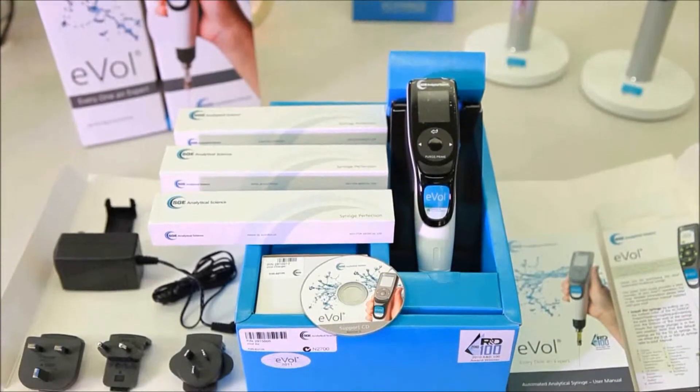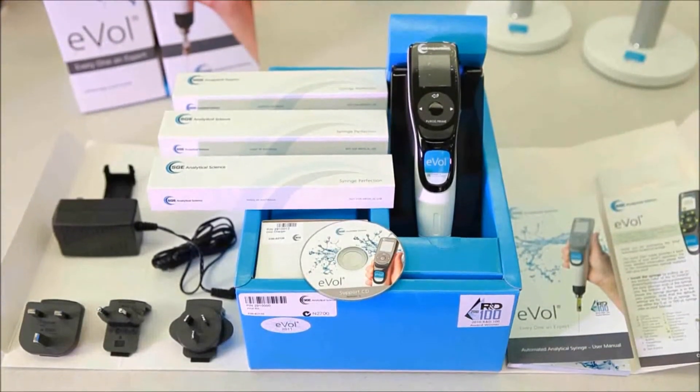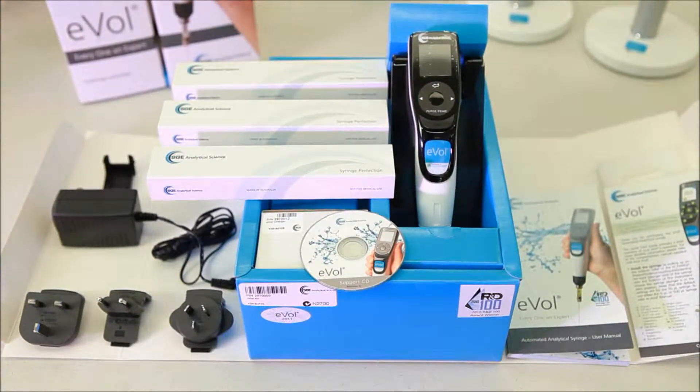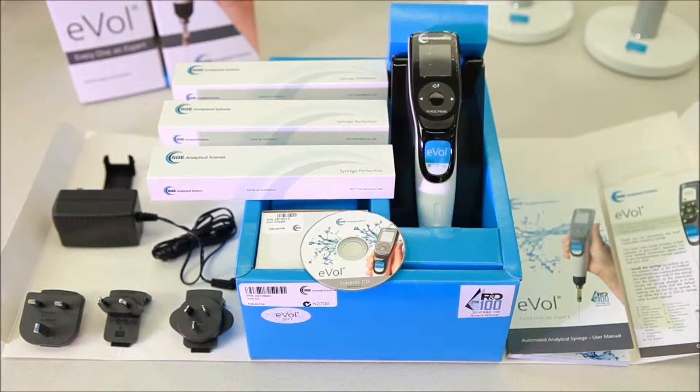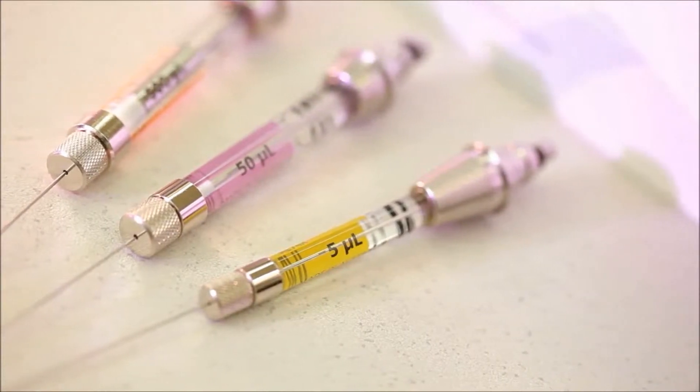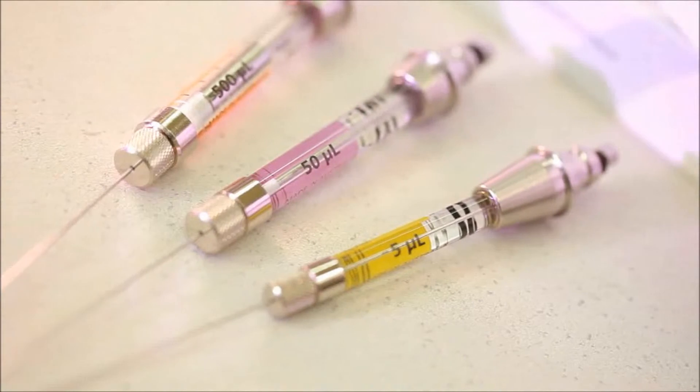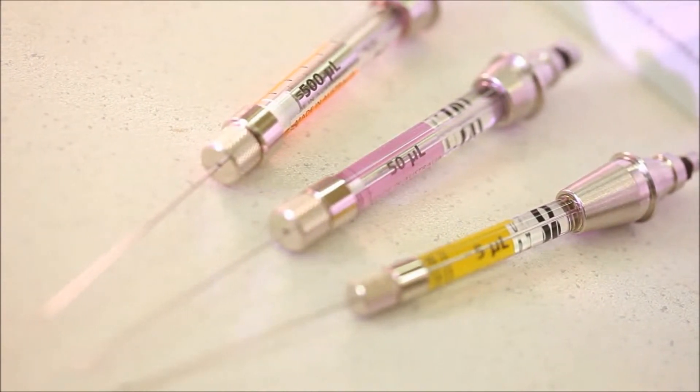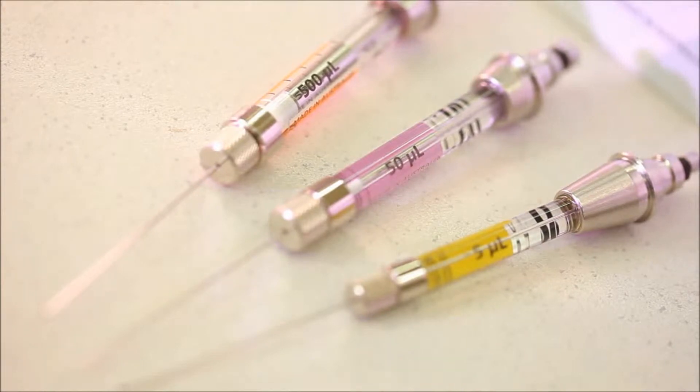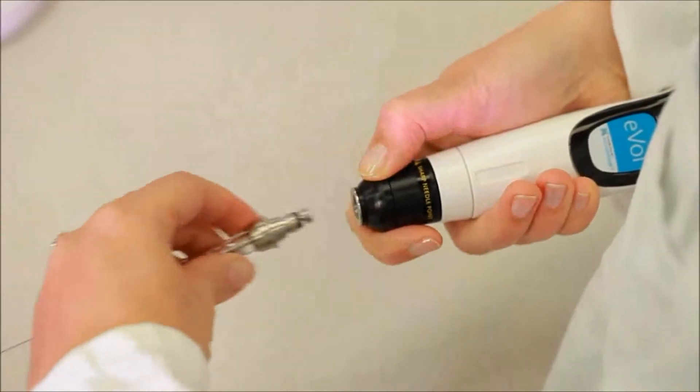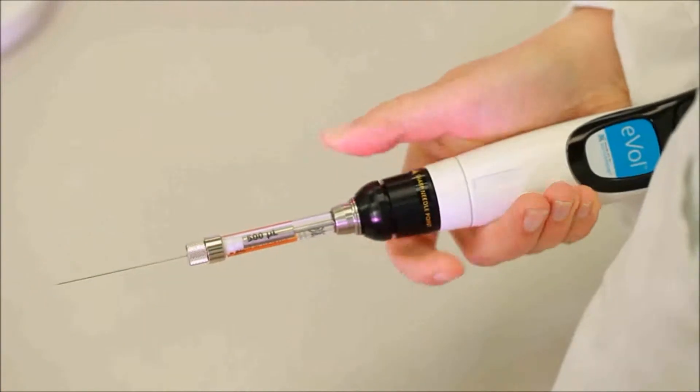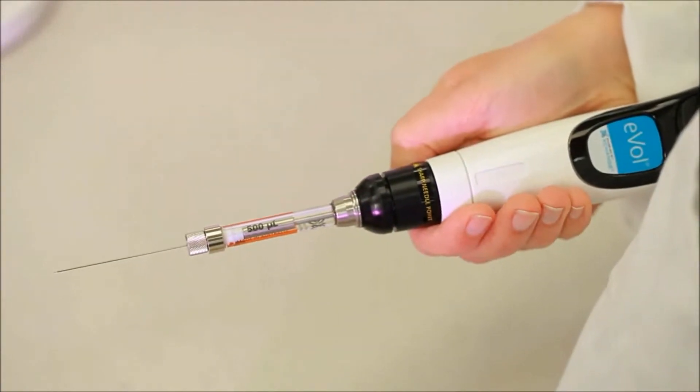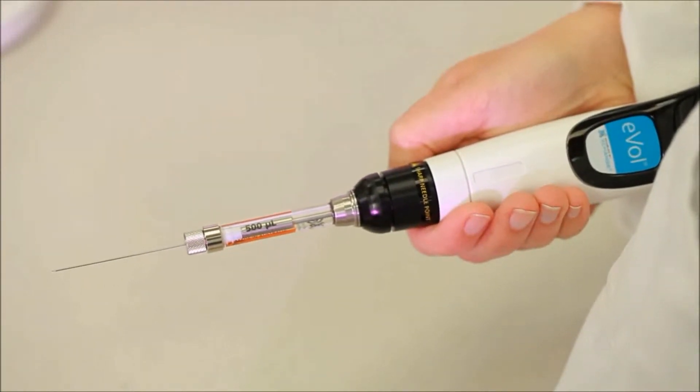The EVOL electronic syringe starter kit contains everything you need to get started, including one EVOL automated analytical syringe handle, one 5 µL, one 50 µL, and one 500 µL EVOL exchange syringe, all fitted with 50 mm needles. The syringes can be easily and quickly changed, allowing them to be dedicated to individual liquids or methods, or to avoid cross-contamination.